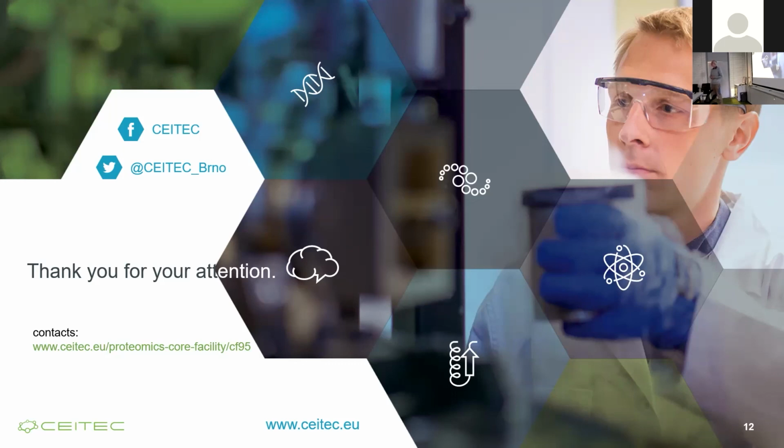Question about the amount of data that your facility generates. How much are you doing? We are approaching tens of terabytes per year. I would say at the moment, just a rough estimate, 50 terabytes per year, but it might be up to 100 in the near future. Because these timsTOF instruments are very fine, but they are producing quite a lot of data.